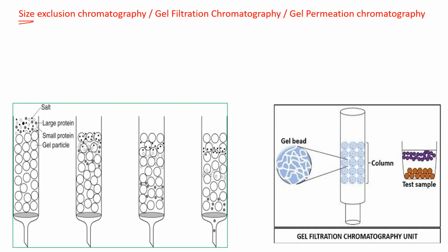Electrophoresis is also a separation technique, which is another part of this unit that we are going to see. It is also a very sophisticated separation technique. But what happens in electrophoresis is that the purified and separated protein cannot be further used, because, for example, if we are talking about SDS page, which is another type of electrophoresis specifically used for proteins. We are going to see what it is later, but I'm just mentioning it here so that when we do that part, you will be able to correlate.